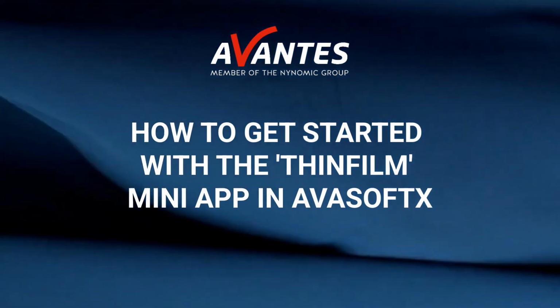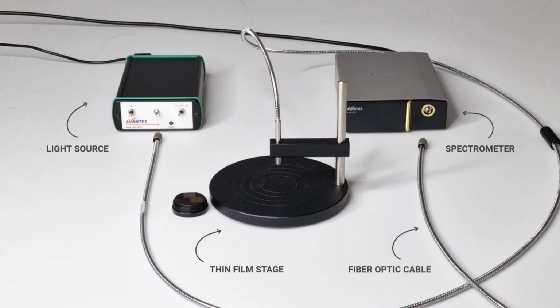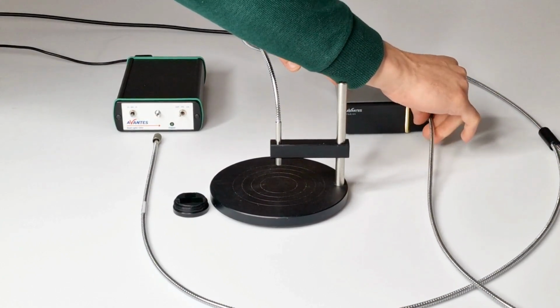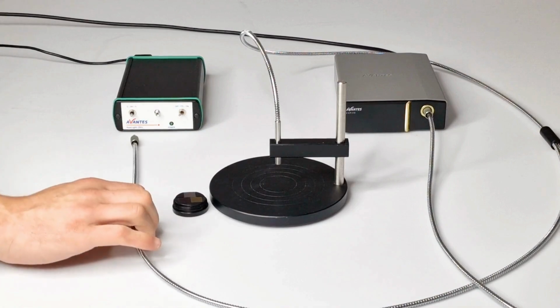In this video, you'll learn how to connect your spectroscopy setup with the Thinfilm mini app in AvaSoftX. You will need a spectrometer, a light source, a reflection probe, and the Thinfilm stage. Connect the collection branch of the reflection probe to the spectrometer, and connect the illumination branch of the reflection probe, identified by its label, to the light source.